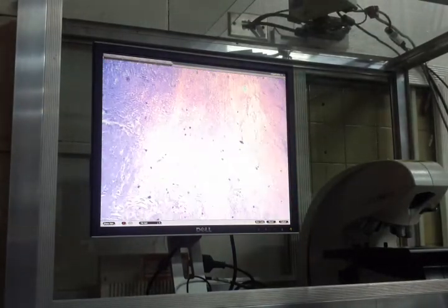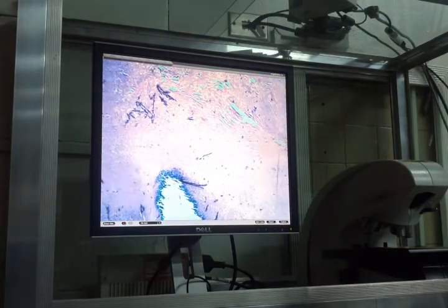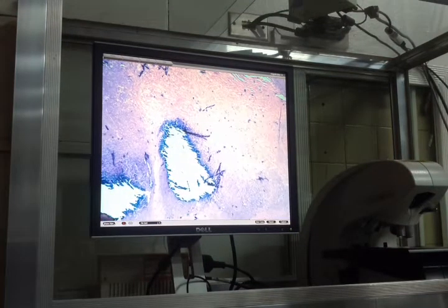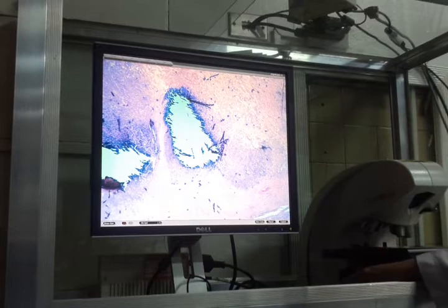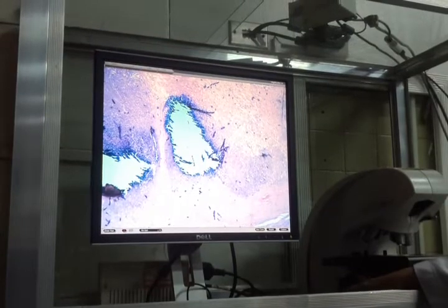Dystrophic calcifications, as mentioned, are calcifications, so they are hard. It is difficult to cut by microtomy, so you cannot get it whole when it is big. Like this one, that's a big dystrophic calcification. Because of the hardness of the specimen, it's not easy to cut it into very thin slices and put it on the slide. That's why you have difficulty getting it as a whole, and that's why it fragments like this.